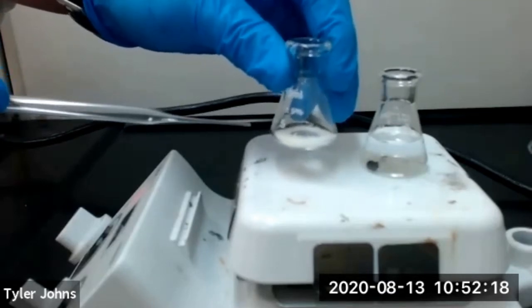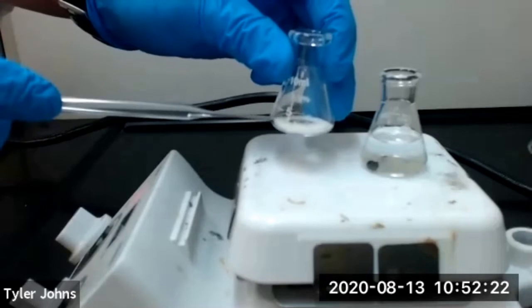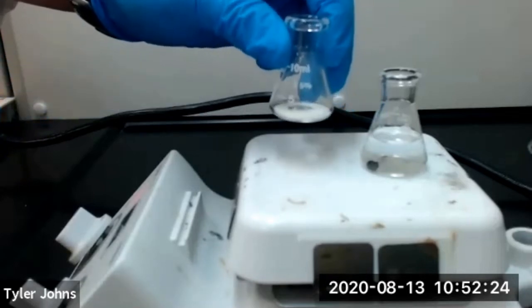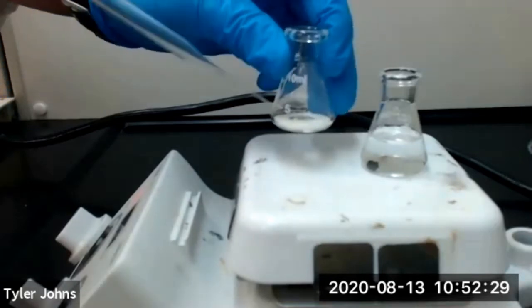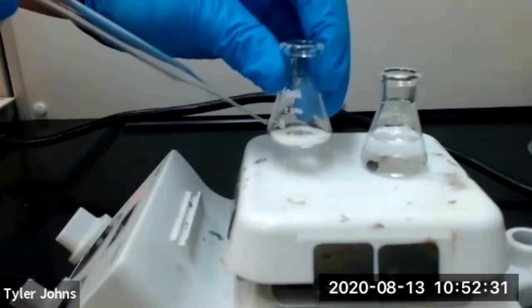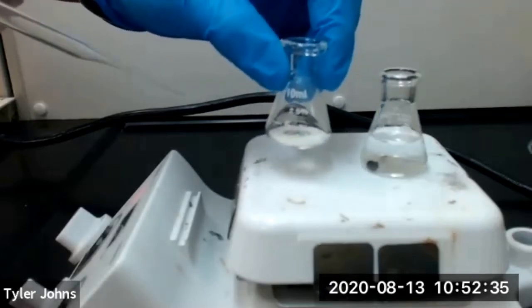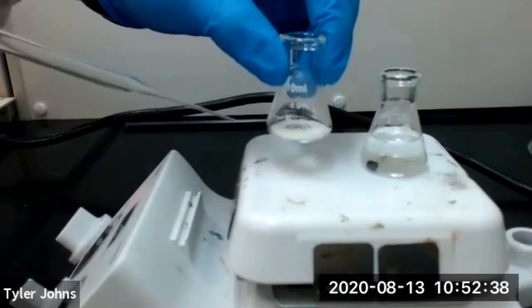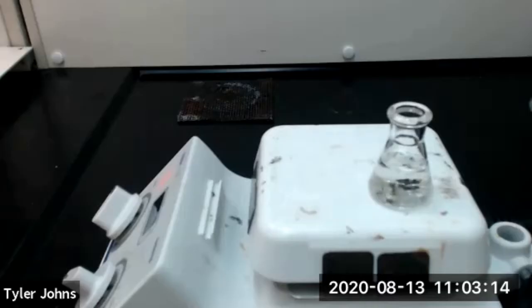Once our impure sulfanilamide and the 95% ethanol have come to a boil, we will transfer a very small amount of boiling 95% ethanol to our Erlenmeyer flask with our impure sulfanilamide and swirl until all of our impure sulfanilamide has dissolved in the minimum amount of 95% ethanol. Our 95% ethanol is now boiling, so we'll begin the process of dissolving our impure sulfanilamide.